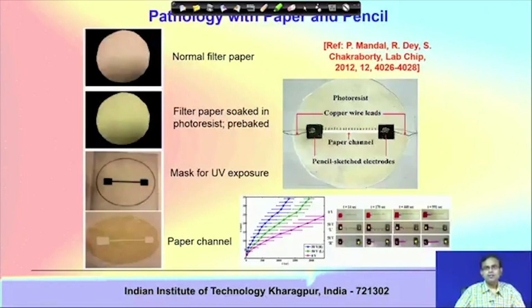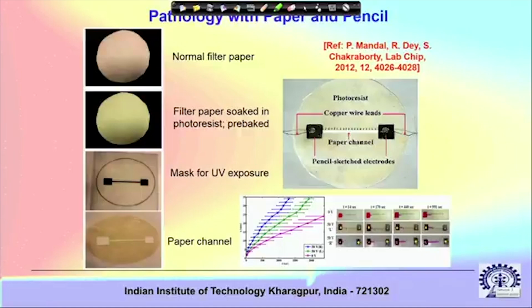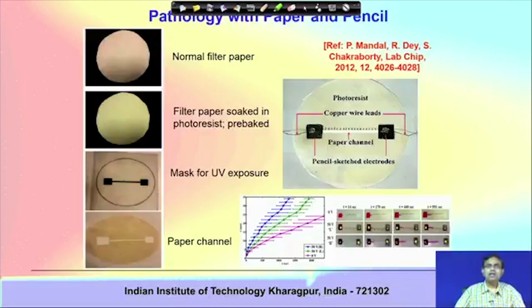Normally, paper based diagnostics is considered to be one of the very important research breakthroughs in the modern era, and this paper based diagnostics was originally introduced by Professor Whitesides from Harvard University, USA. Although paper based diagnostics is a very simple procedure, what essentially you have to do is make microchannels on paper.